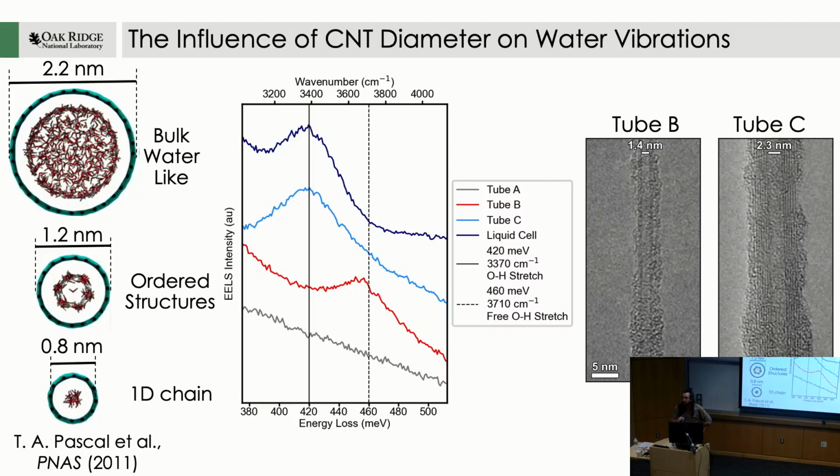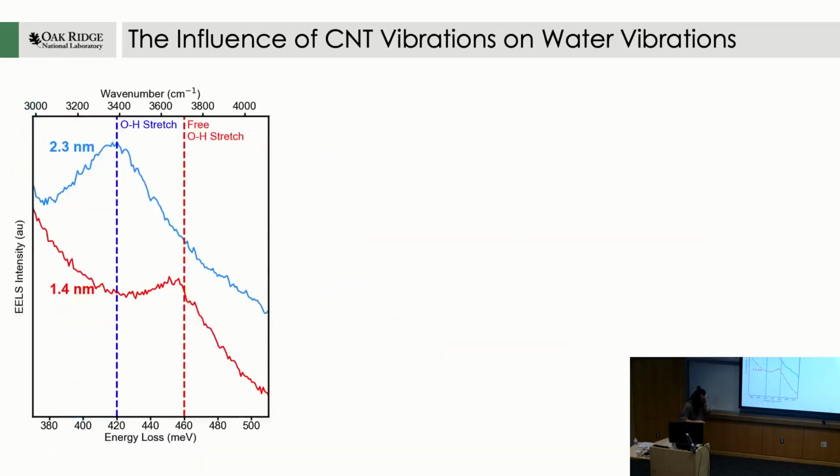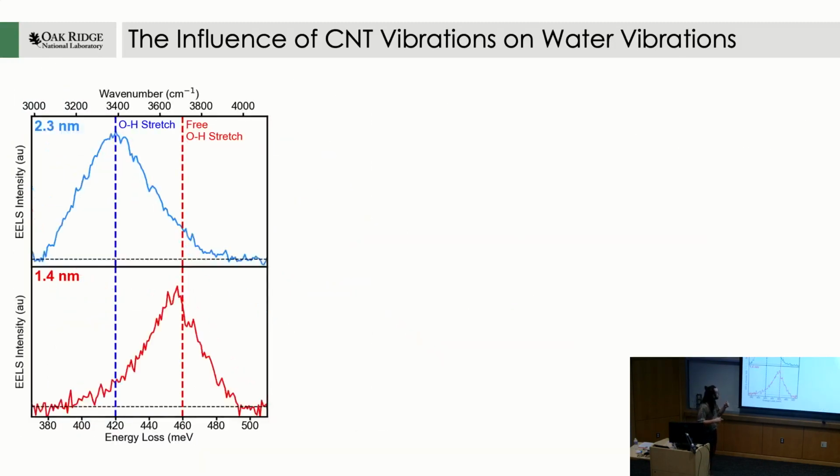And this actually really nicely corresponds to the theoretical predictions of where you should transition from these ordered structures of water to more bulk-like water. So we really think this is a strong indication that we can use the vibrational response detected in EELS to understand the structure of the water inside the tube. But we can even go one step further. Let's just do a little bit of background subtraction to make this look a little nicer. But we can also use the vibrational fine structure that's given to us by having this ultra high level of energy resolution. So it's not just the peak position, it's the peak shape we're interested in.